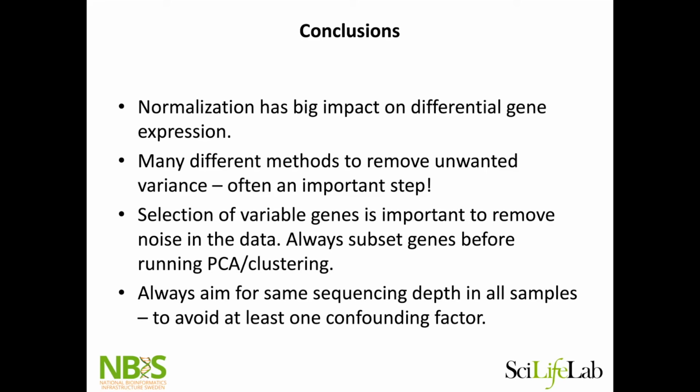I've had studies where they had one sample with 10,000 cells, another with 1,000 cells, because that's what they could get out of their patient samples, more or less, and then another with 5,000. And they ended up with very different sequencing depths, very different gene detection per sample, which just increases the batch effect quite a lot. Then normalization will be easier if it's fairly even across your samples.